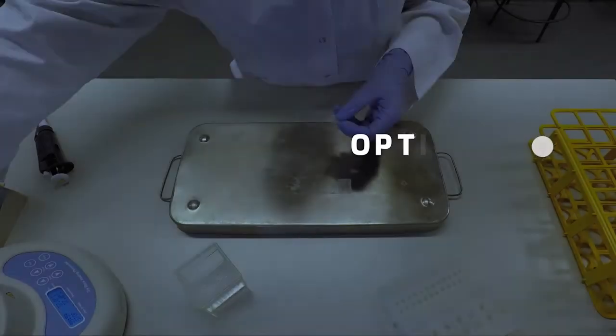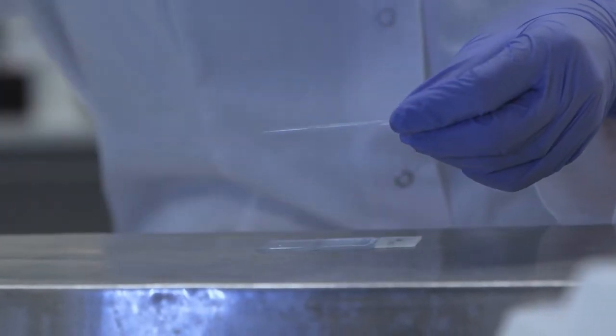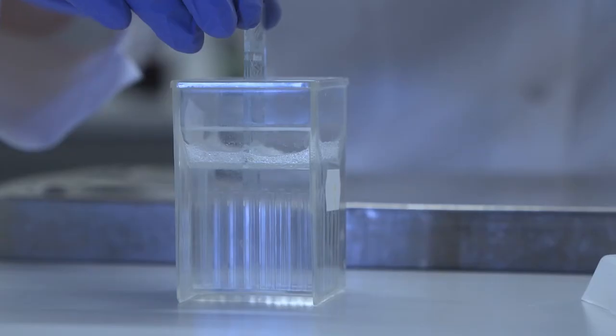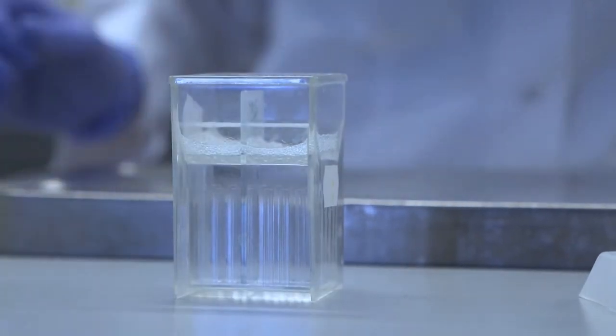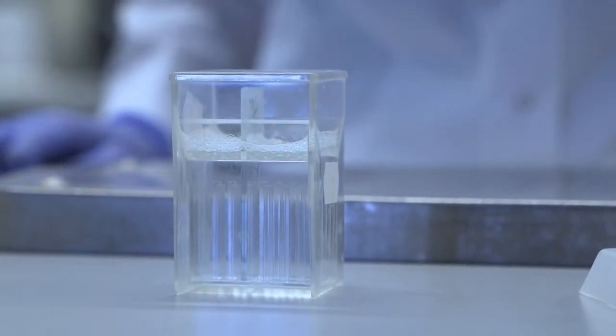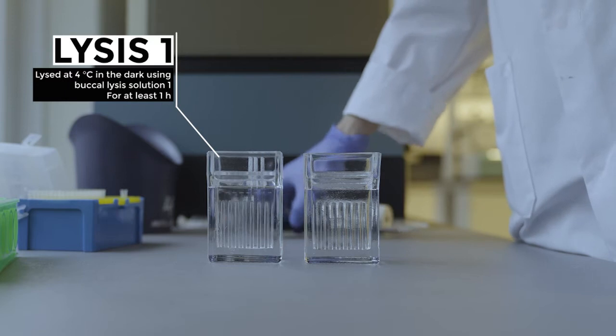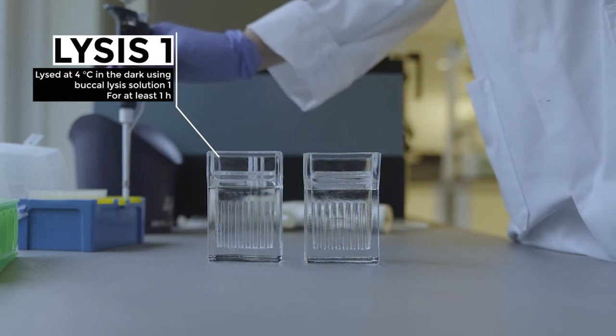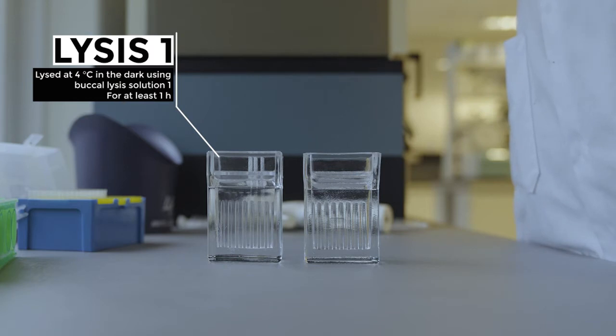Carefully remove the coverslips and perform lysis. Human buccal cells require two lysis steps. First lysis at 4 degrees Celsius in a dark jar. The slides should be immersed in alkaline buccal lysis solution 1 for at least one hour.